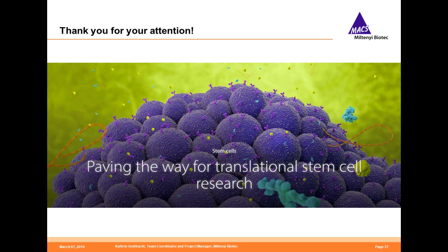Okay. The next one is, what markers do you include in your MSC phenotyping kit? The MSC phenotyping kit includes CD73, CD105, and CD90. They are the positive markers, and it includes a set of negative markers, which are CD14, CD20, CD34, and CD45. The cocktail does contain PE, FITC, APC, and PerCP. It's also possible to combine some other markers with the cocktail, for example, HLA-DR. All these markers in combination are in line with the criteria defined by the ISCT consortium.